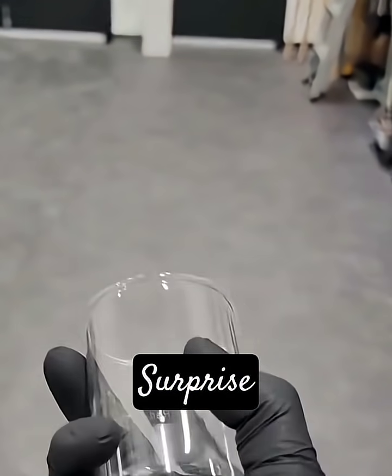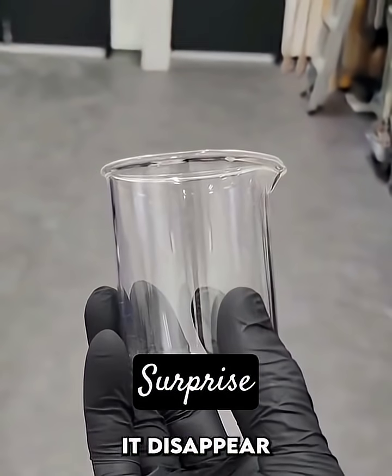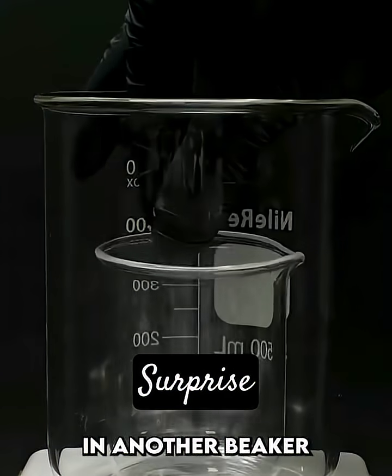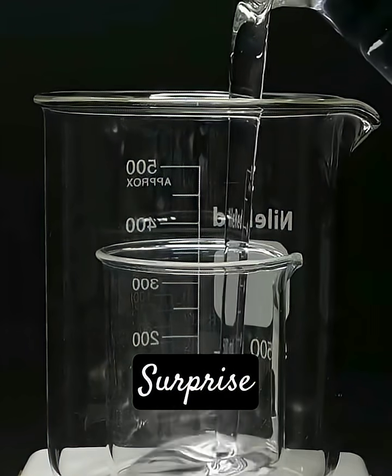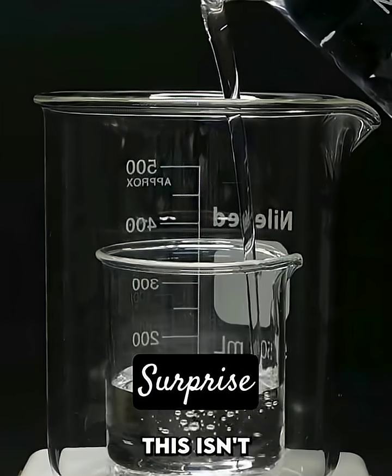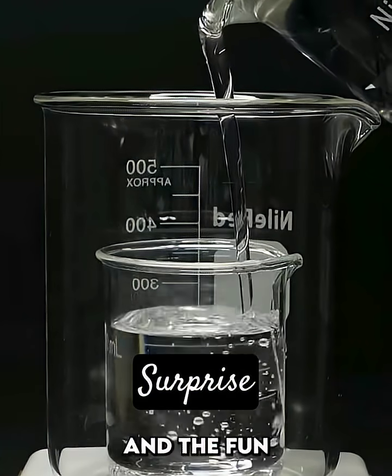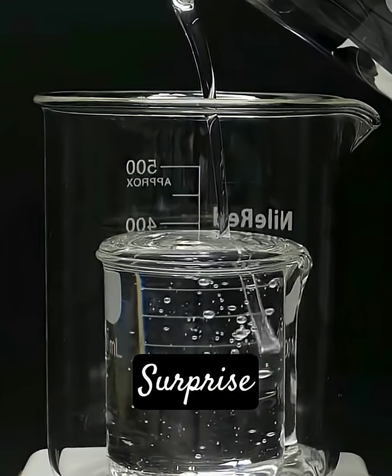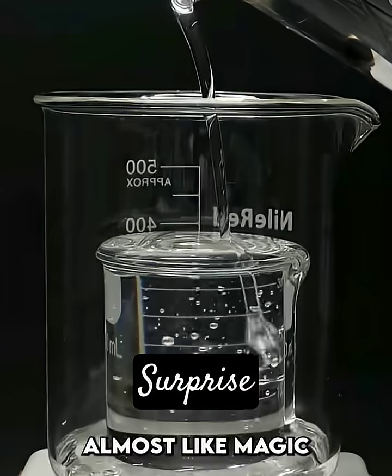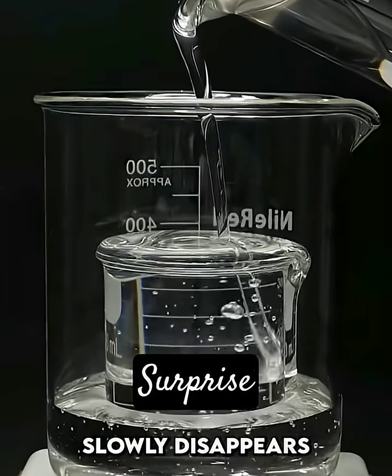This is just a regular beaker, and I want to make it disappear. To do this, I'll put it in another beaker and I'll pour in a goopy liquid. At first, this isn't too interesting, and the fun only happens when the goo starts overflowing. Now, almost like magic, the beaker slowly disappears.